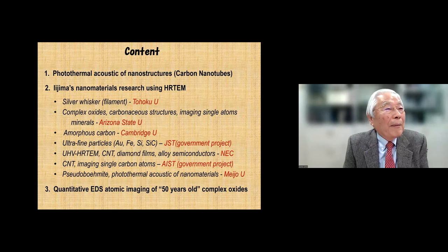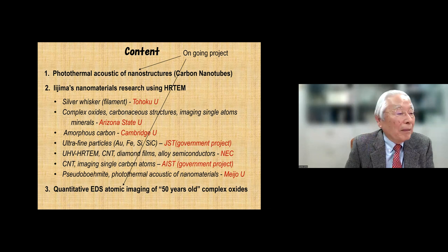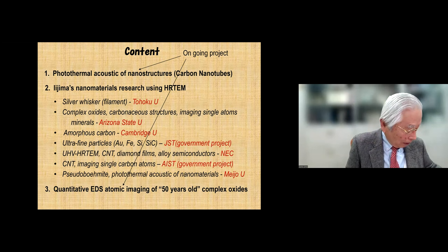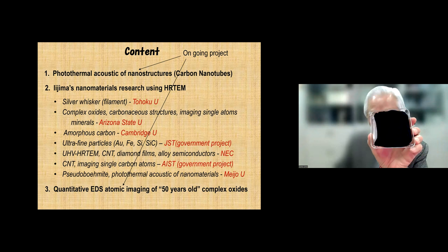I can't see this up here, but these are ongoing projects by my own, right? Then I'd like to show some simple experiment, okay? So before going to the next one, here I have the carbon nanotube, what we call the mat, okay? Quite black stuff, right?